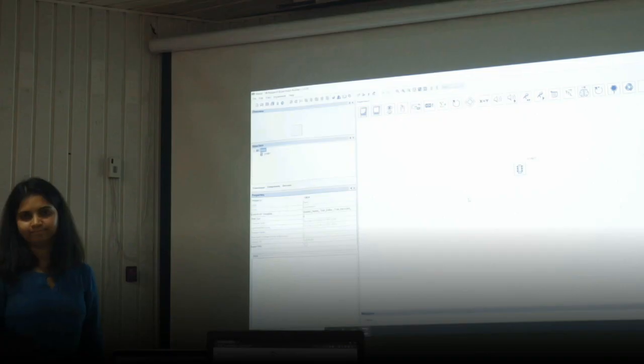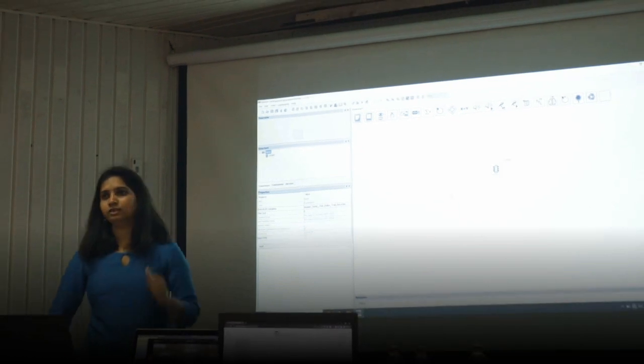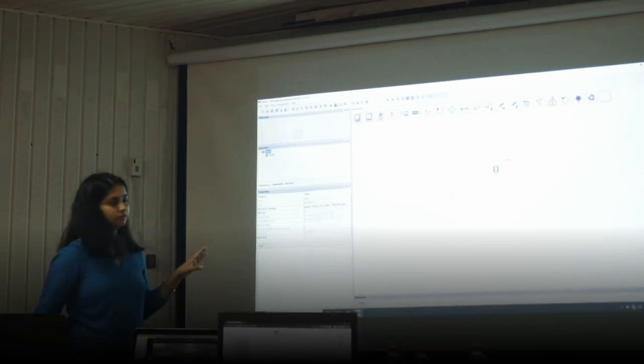So this is what Experiment Builder looks like.